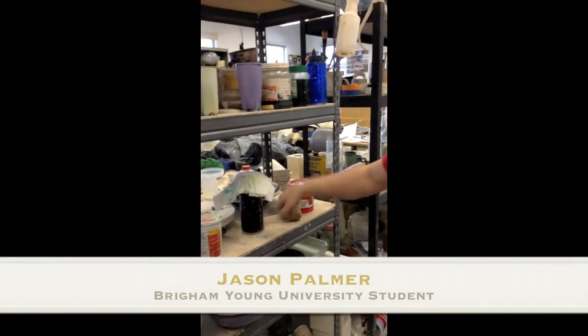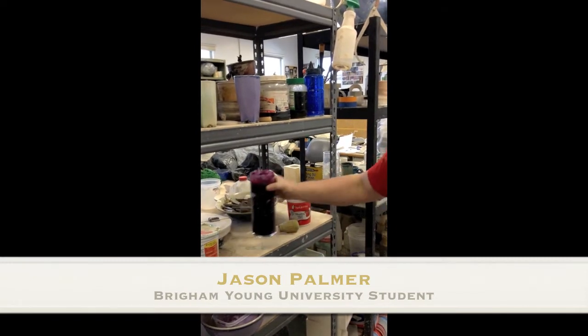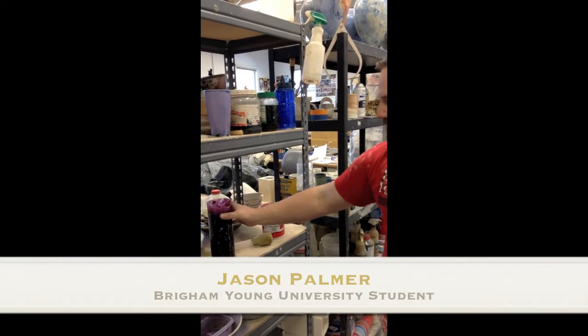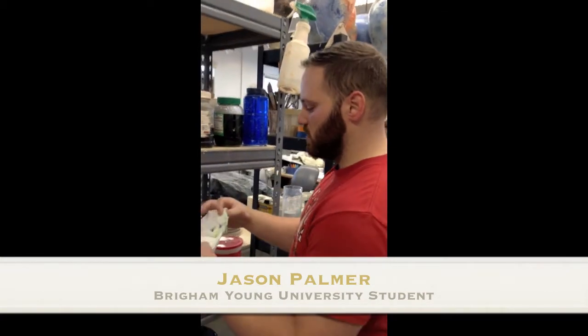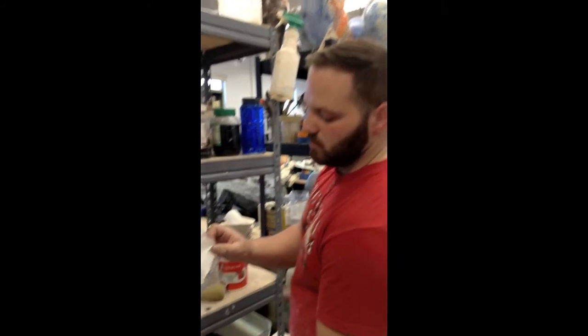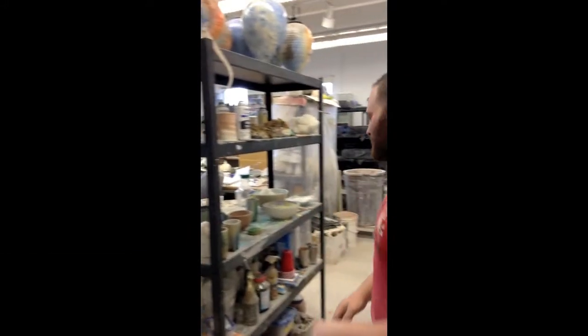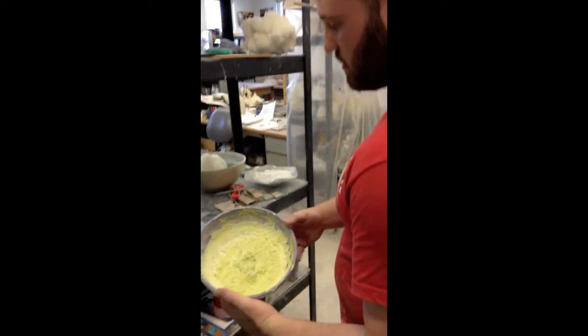So I've got copper sulfate, this one in here, these purple crystals, there's a big giant crystal growing in here. That is cobalt chloride. I've got bunches of other ones. And look, it ate through my napkin. They're not exactly the best chemicals to play around with and eat. So we have this, which is stannous chloride.